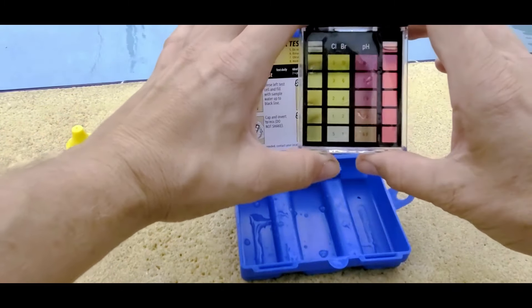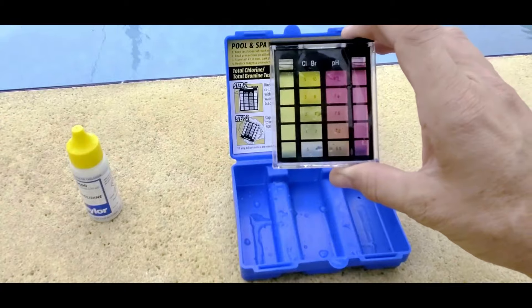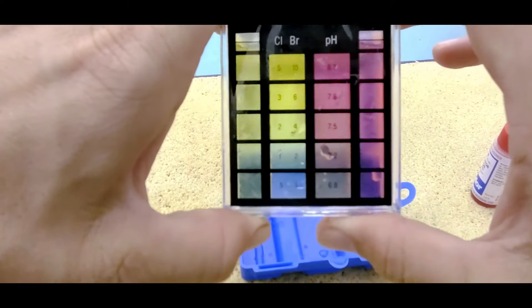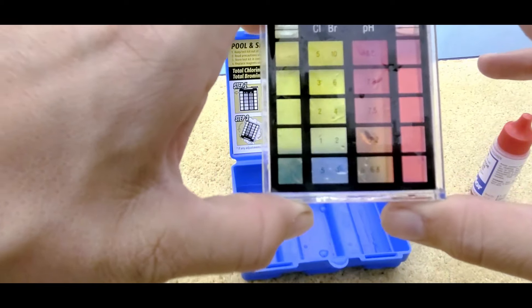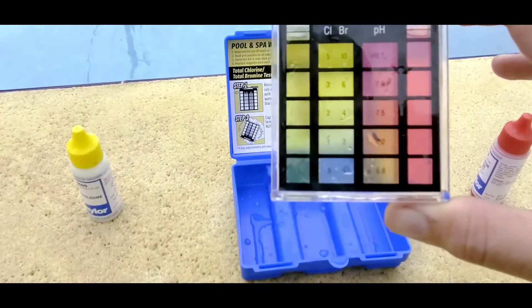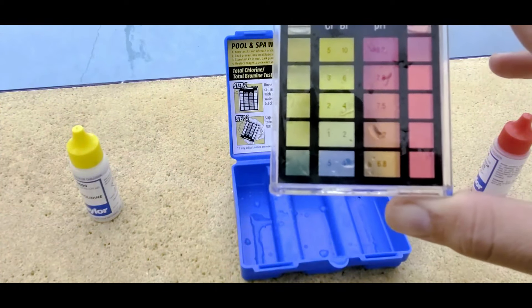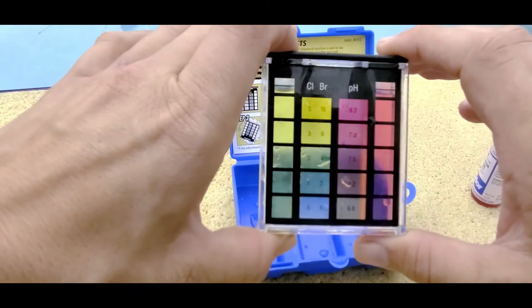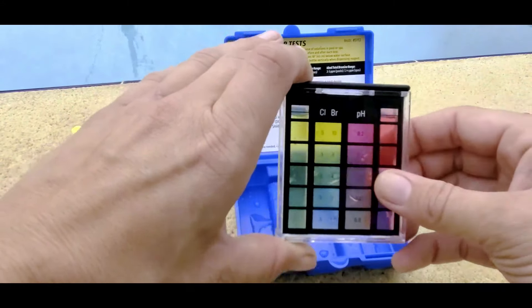And I would say it's kind of hard to tell in the video, but it looks like about a 7.8 on the pH. And I would say around a three to a four for chlorine. Just looking at this, I think my pool is fine. I mean, it's that simple.